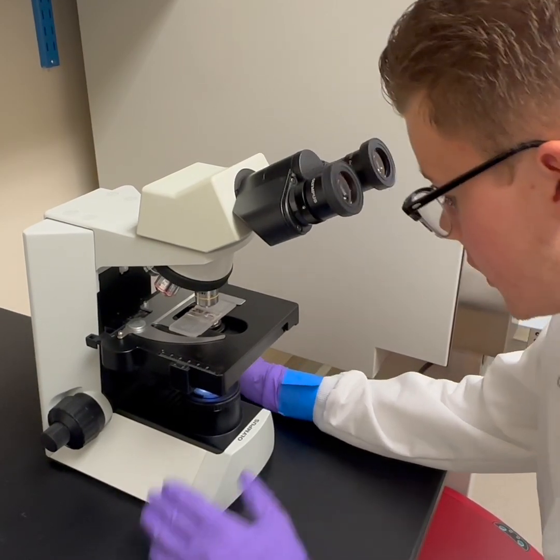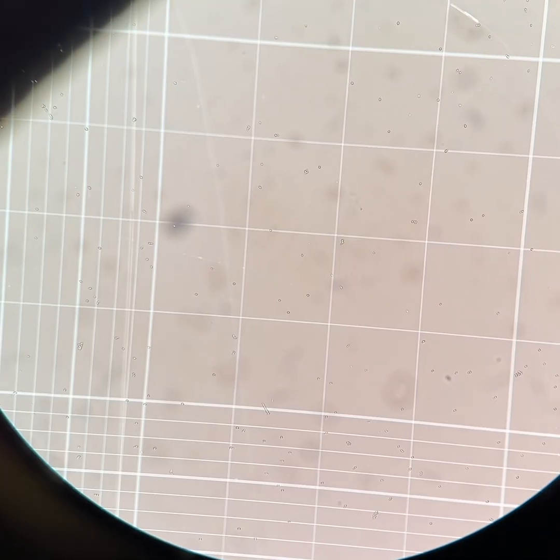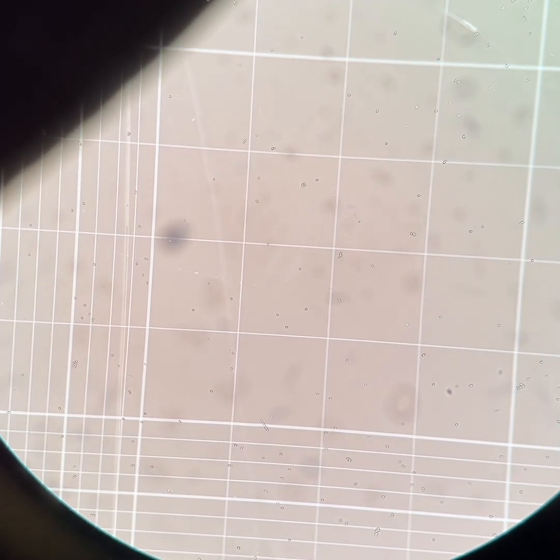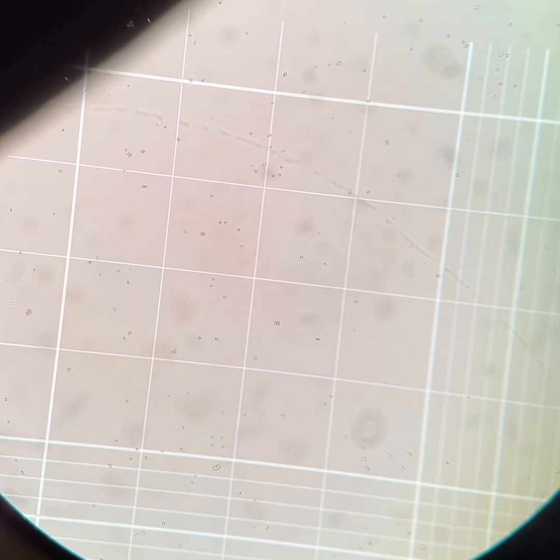All right, and you might consider changing the diaphragm and the light really quickly. All right, so we have it at 10x. You can actually also go to 40x, but I'll just show it here. So you're going to count all of the grids, from top left to bottom right. You'll see there's 4 corners with a cross in the middle. Each of the corners contains 16 squares. Okay, you're going to count all of the cells in those.